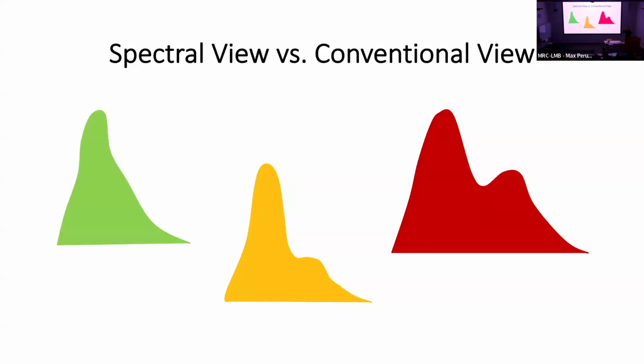In conventional flow cytometry, you wouldn't necessarily be able to see if it's starting to fall apart. In a spectral view, because you're getting the full spectrum of that particular fluorophore, you're able to see if the tandem is falling apart, if it's starting to have cross-beam excitation at different points, and ultimately extra emission across the range of wavelengths.